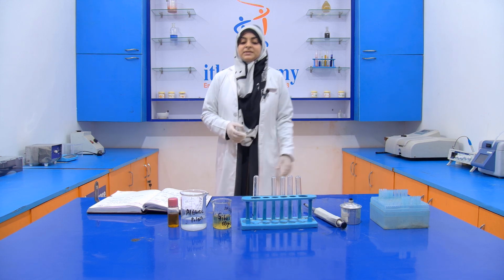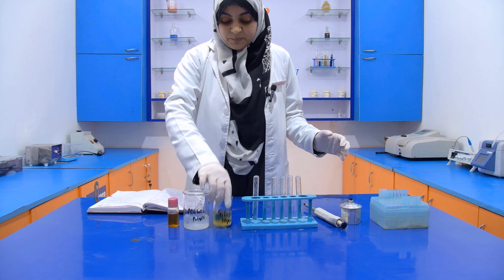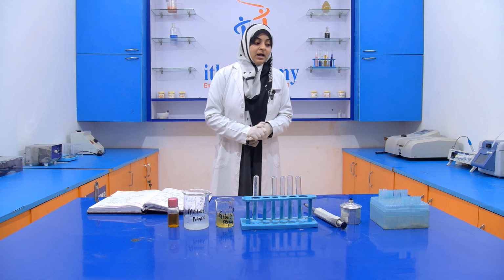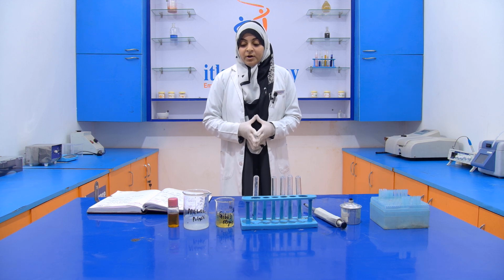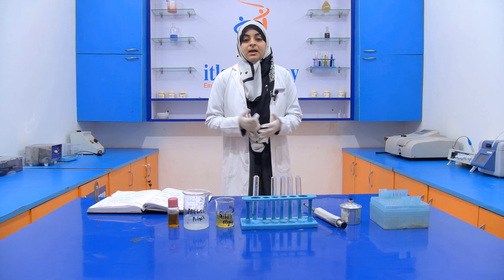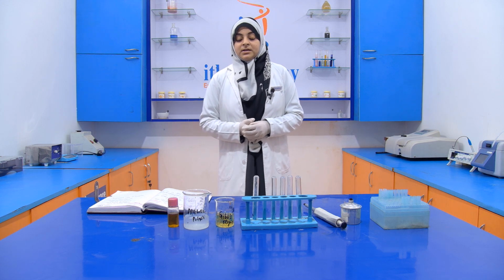So for performing this experiment, we require two chemicals. One is alcoholic potash and another one is Gibbs reagent. This is your Gibbs reagent and this is your alcoholic potash. Now, first of all, we have to know how we prepare this alcoholic potash. Alcoholic potash is also known as alcoholic potassium hydroxide solution.